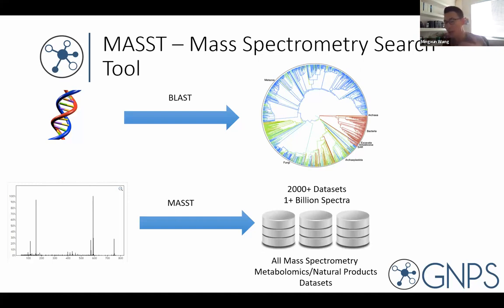And then what we can do is go to all the data sets and all the data that's ever been published before. We do some clever indexing and pre-processing on this data so that we can start doing the comparison and answer the question: in what context, in what data sets, in what metadata have we ever seen the molecule that you're looking for, right? As you have seen, when you run these untargeted metabolomics experiments, you end up with thousands to tens of thousands, and depending on the scale, maybe hundreds of thousands of analytes in your data. The vast majority of them are unidentified to known structures. So you probably want to get a little bit more context before you get the structure out, right?